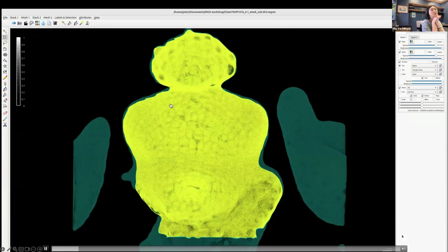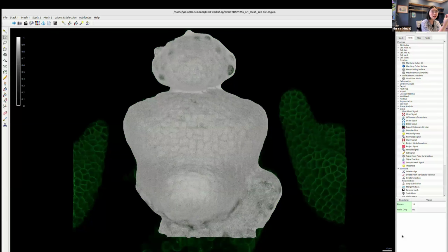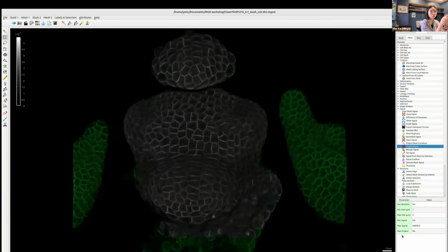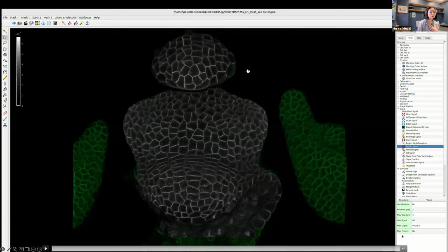Now we can project the signal from our actual Z-stack onto this mesh that we processed, through a process called project signal. This is a process where you have to experiment with different numbers for your particular sample. I'm showing here that different numbers have a very different effect for the projected signal, right? So just now 4 and 6 is too distorted, 1 to 2 is very light. So the general rule of thumb is that I keep it consistent for all my samples across experiments. And after we project the signal, now it's the fun part, which is, where's my mouse?